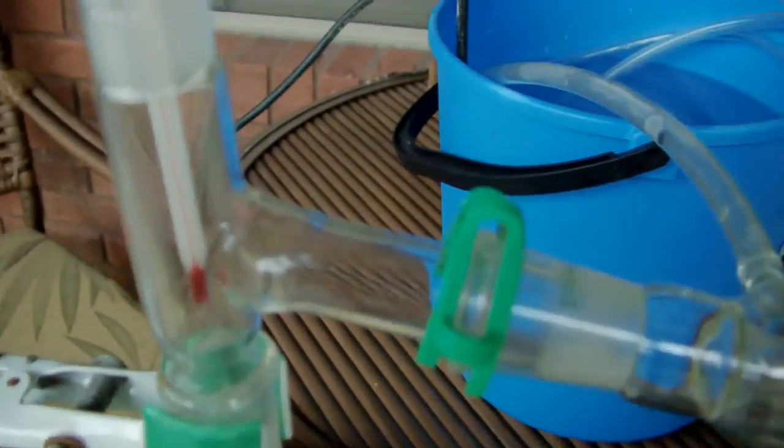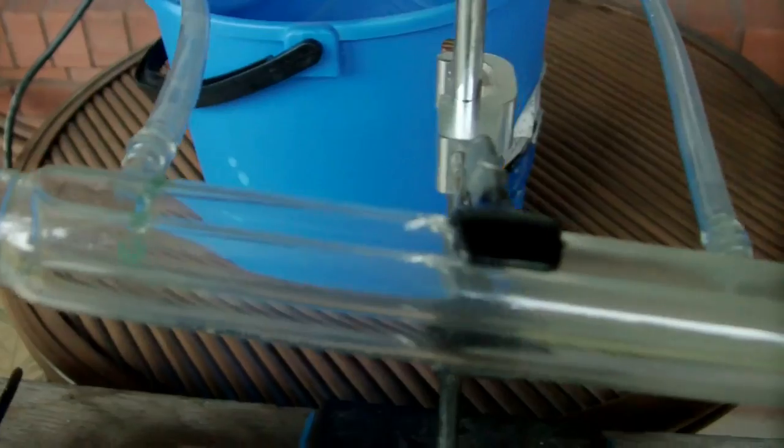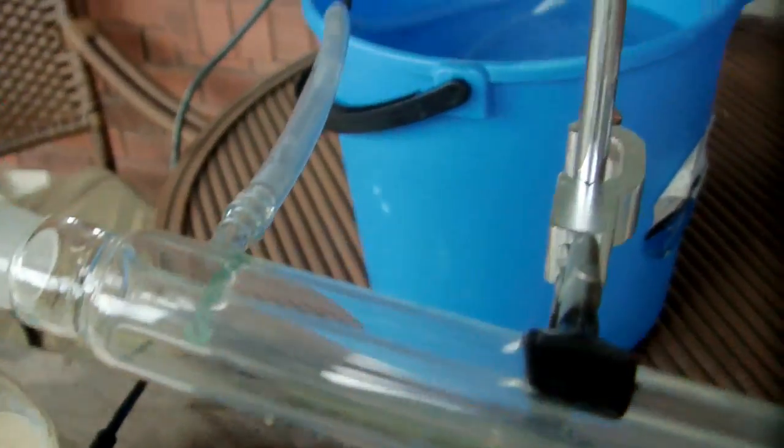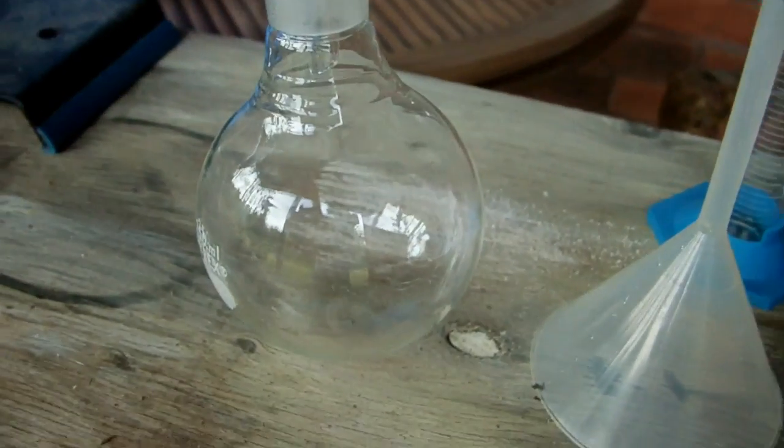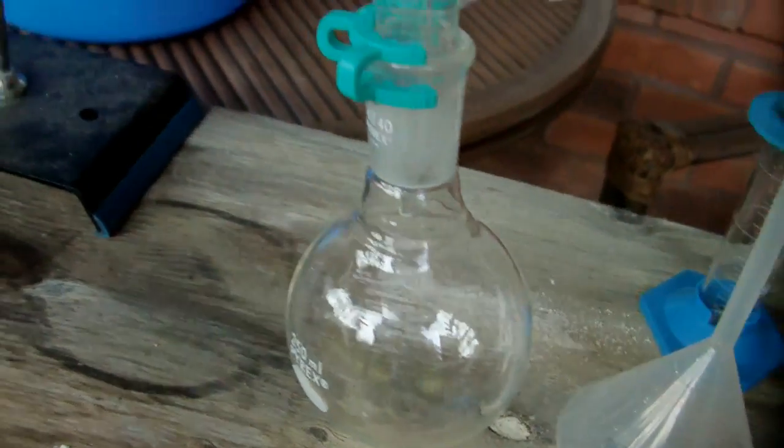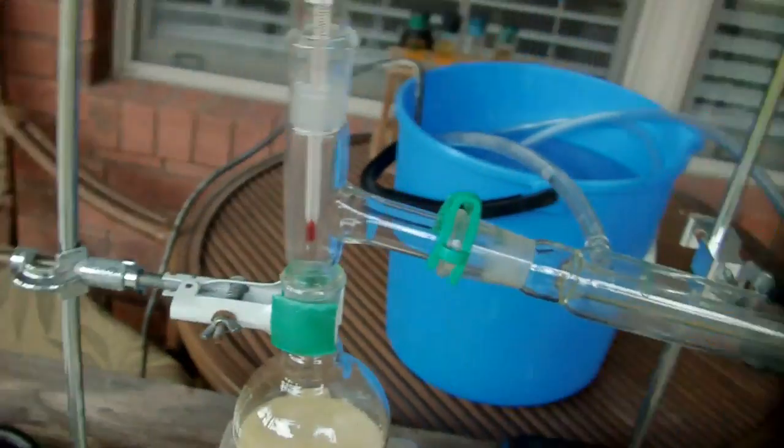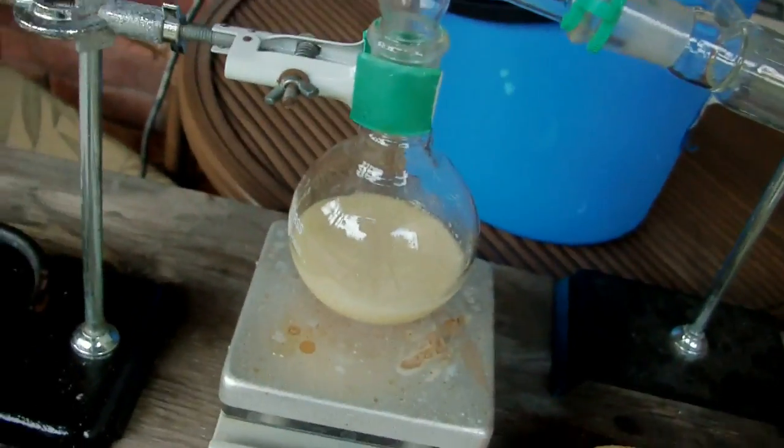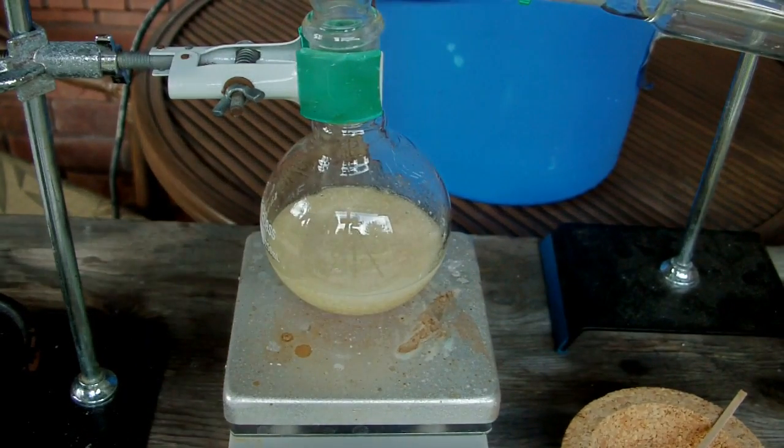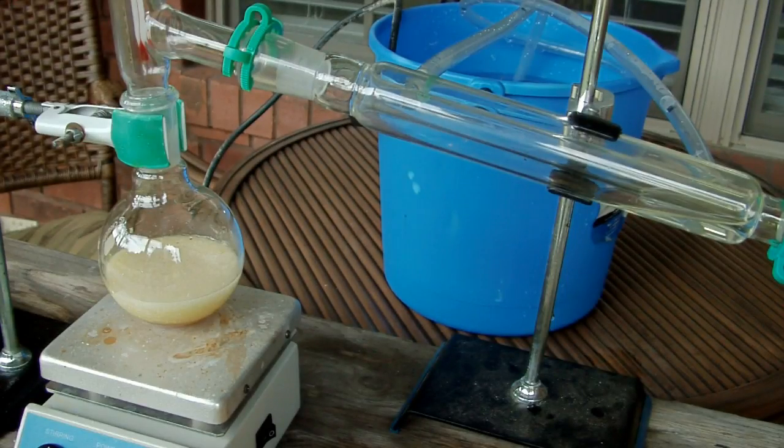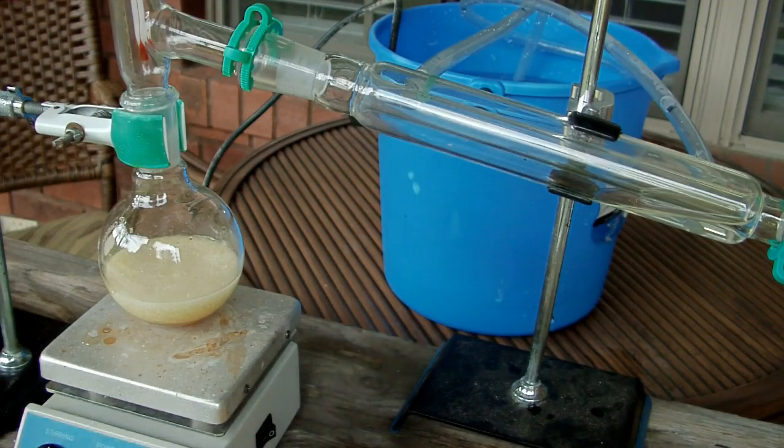That's where some of the vapors will condense, and then they'll go into the condenser here, which is where the rest of them will condense. That's water cooled by a bucket back there. Then that goes into an adapter to the collection flask, where I'll collect my nitric acid. So I need to heat this up to 83 degrees Celsius for the nitric acid to start coming over.